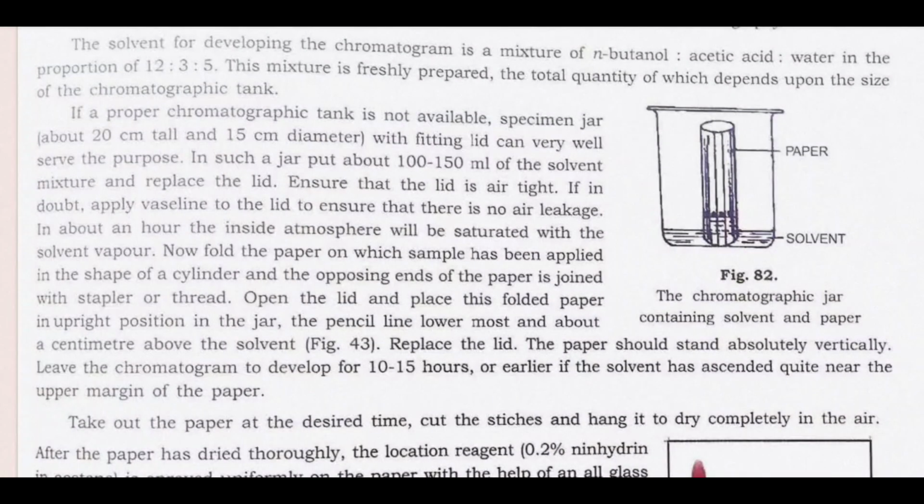Now fold the paper on which sample has been applied in the shape of a cylinder, and the opposing ends of the paper are joined with a stapler or thread.